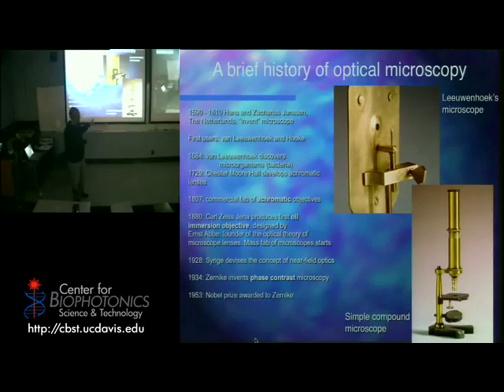Probably some of you may have even used microscopes that looked just like this or very similar to this. I know I did, and this is like a 300-year-old model. They've gotten better, and I'll be showing you one in a second. But just to show you that there's been continuous progress. And basically, when you look at the progress in microscopy, what you see is new techniques being created. That's the main thing that you see over time.